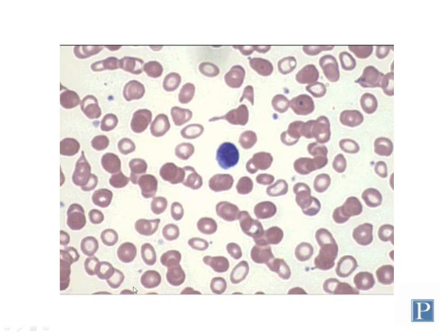Here's a blood smear that has a lymphocyte in it, and a lymphocyte is a type of agranulocyte because they do not have granules in their cytoplasm. Lymphocytes are very common. You should have no problem finding them. They are the second most common type of leukocyte overall, behind neutrophils. And so there aren't quite as many as neutrophils, but there are a lot more than eosinophils and basophils, so you should be able to find them. Lymphocytes come in a variety of sizes, so looking at their size is not the best way to identify them.